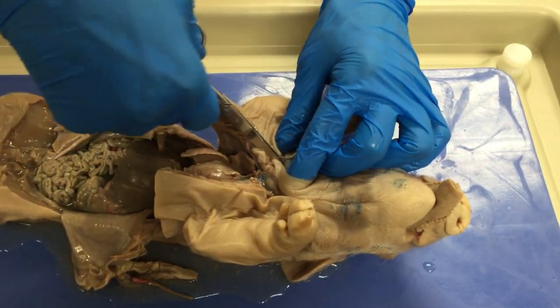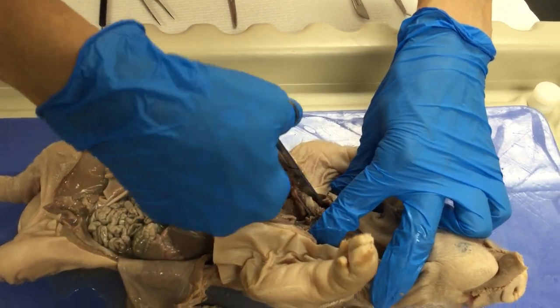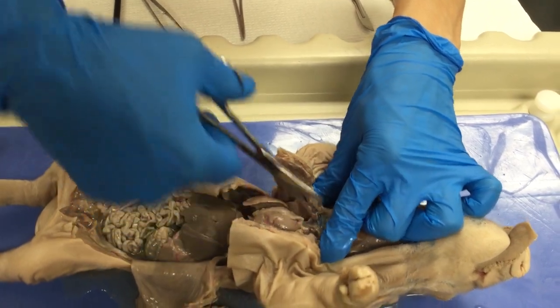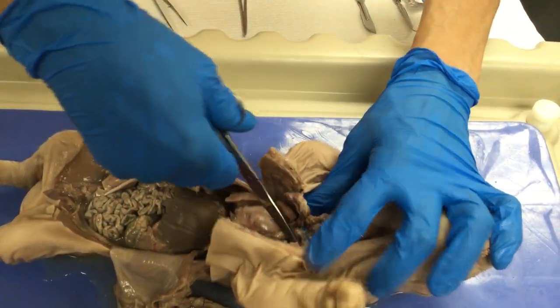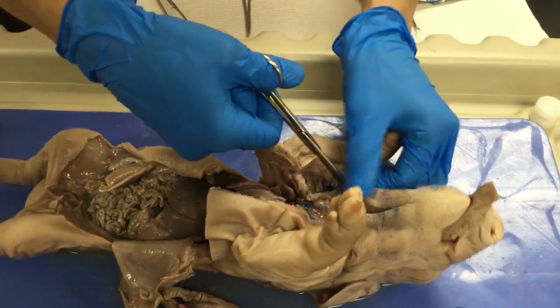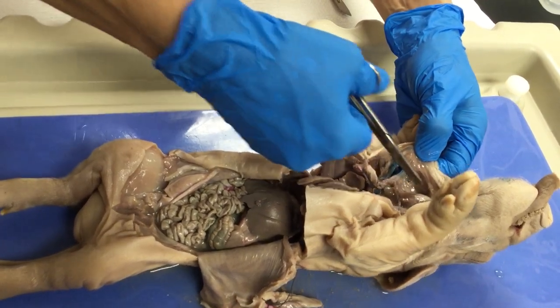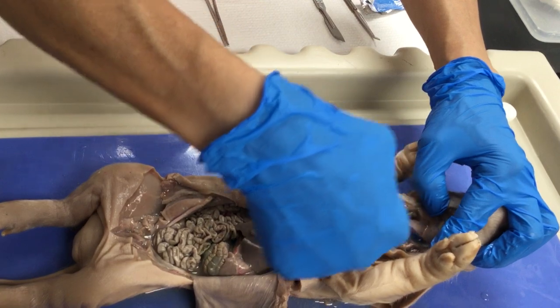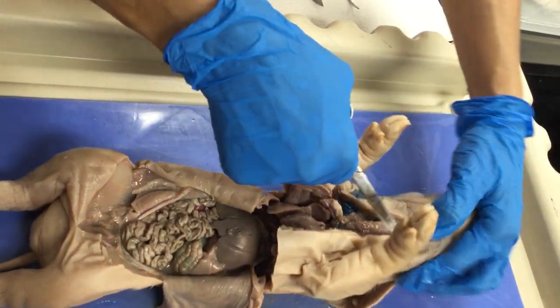Let me now free up a little bit of tissue here within the thoracic cavity so you can see better the structures in the neck. This fetal pig has been injected with latex in the veins, represented with blue color. Here for instance you can see some of the cervical veins — the veins that provide blood supply to the structures in the neck.